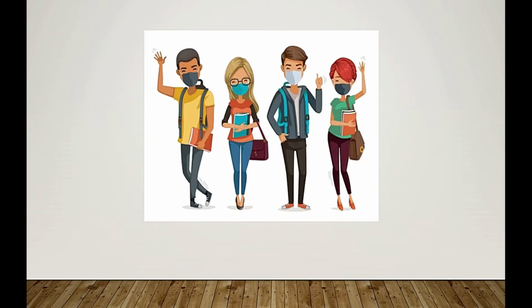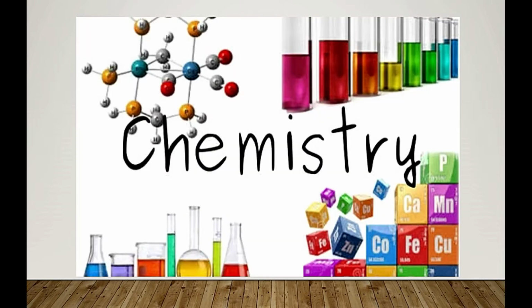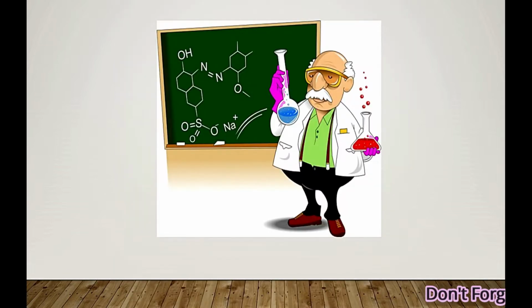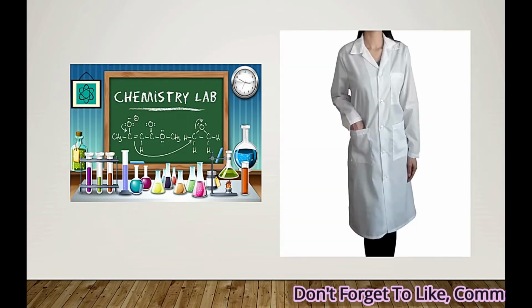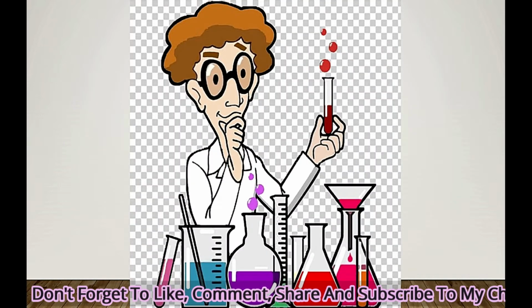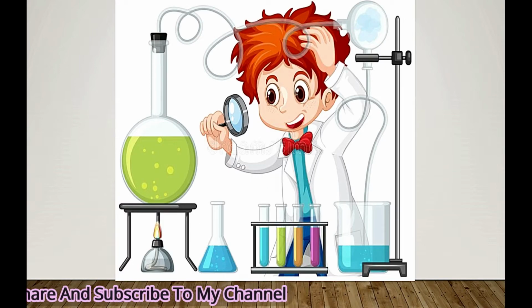My dear students, when you enter class 9, you study so many new subjects, just like chemistry. So you will study chemistry for the first time. The best part of studying chemistry is performing chemistry lab, wearing a lab coat for the first time, and working with so many new chemicals, colorful chemicals, and observing changes.